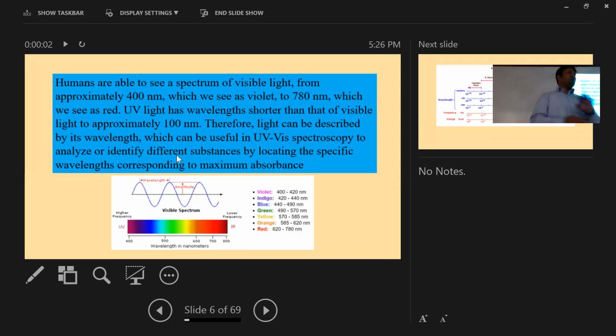That means if you give that energy with a laser, and this pointer is also a kind of laser, known as a laser pointer, we use it to shine on a molecule so that it can absorb and remove one electron, and we can get an ion of the molecule.